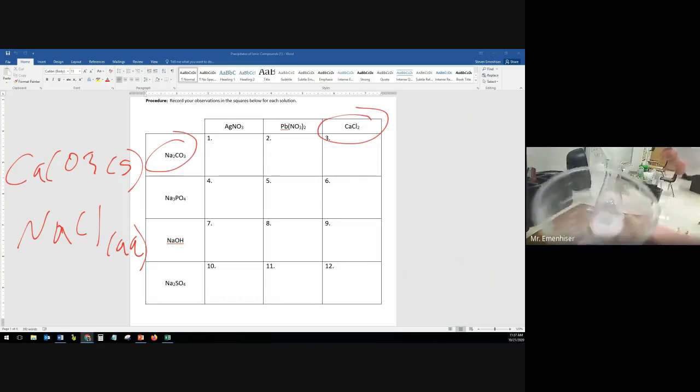Why is this not giving me any water? It's got to be closed if you want it to work. Okay. So here's our water. Notice that it's clean on the bottom now. Right, and so I got all that solid in the water. And so if I mix it around a little bit, pour it into our funnel, we should get some solid. And that's awfully milky. Okay. And then I'm going to let this sit in here.